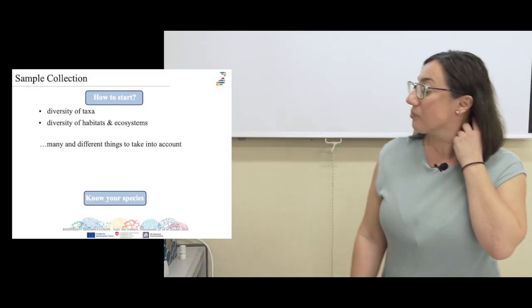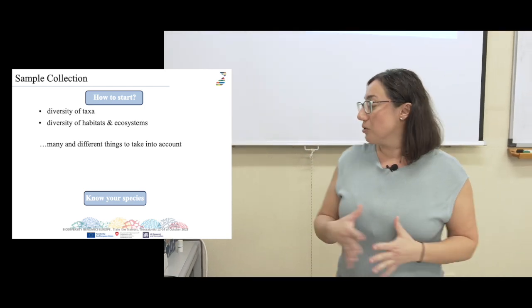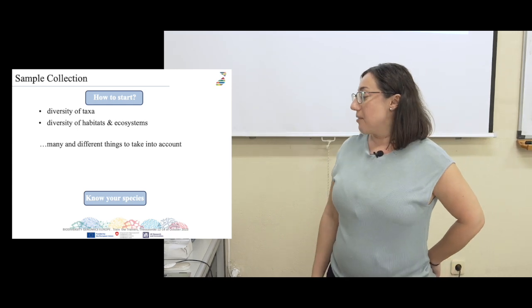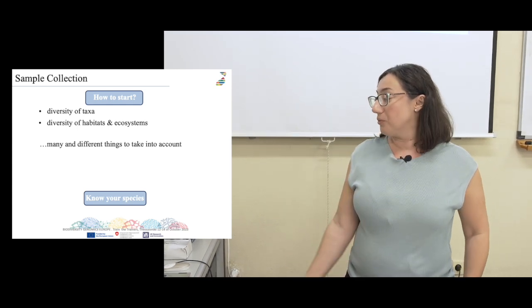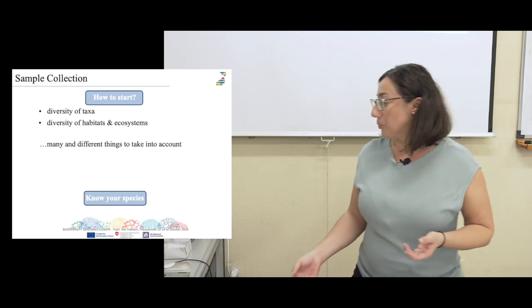So as I said, I'm going to start talking generally about sample collection. Due to the diversity of taxa and the variation of habitats and ecosystems species live in, there are for sure a lot of different things to take into account when you are preparing to go sampling.